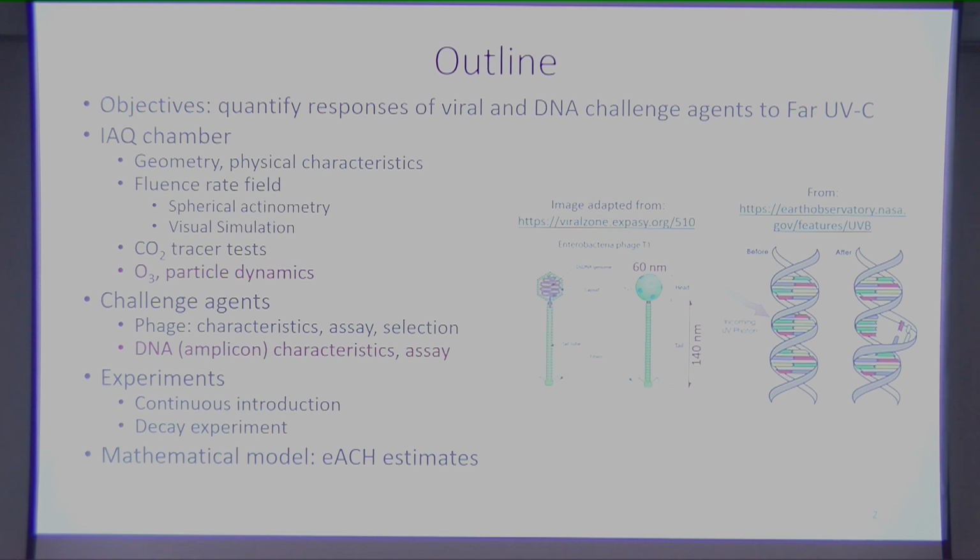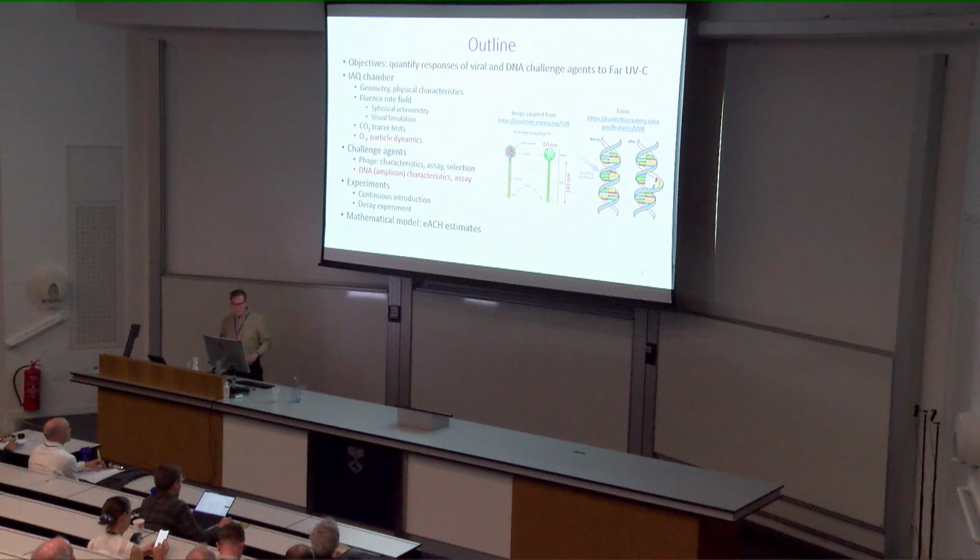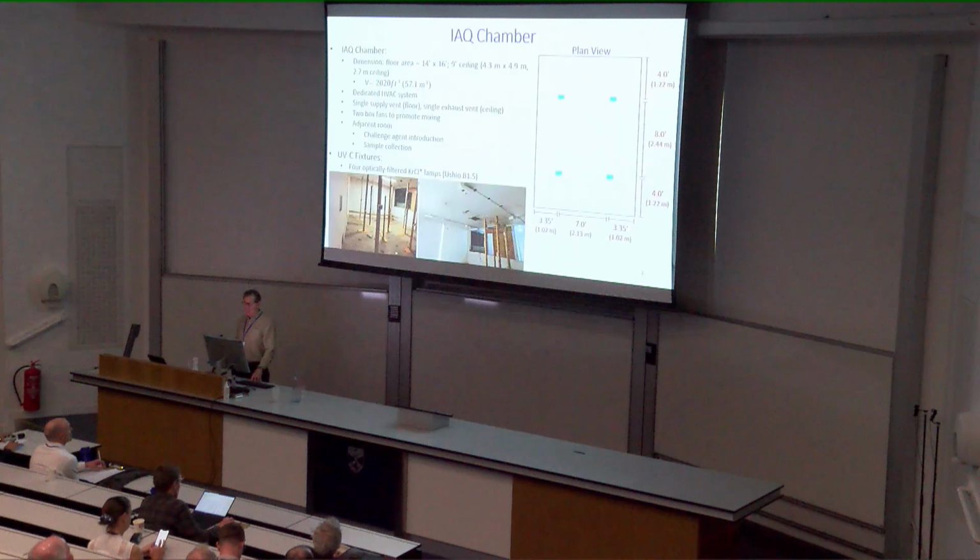Then you terminate the introduction of the challenge agent and turn on the UV system. And then I'll conclude by presenting information relating to the mathematical model that we just used to describe the behavior of both experiments, and from which we developed estimates of equivalent air change.